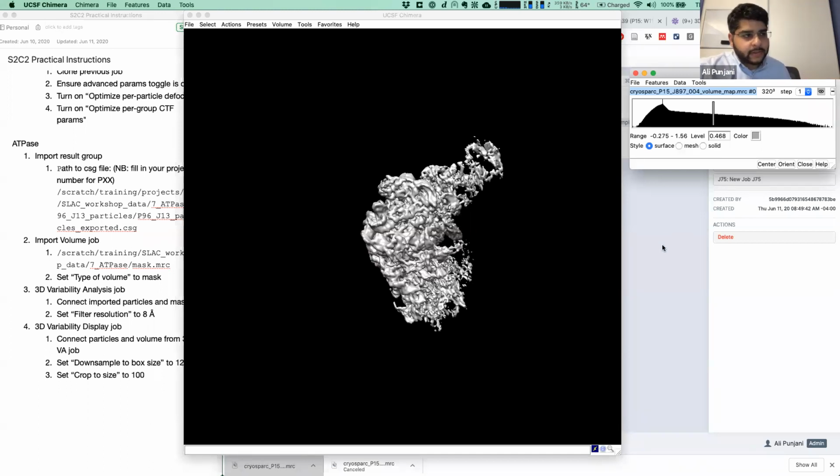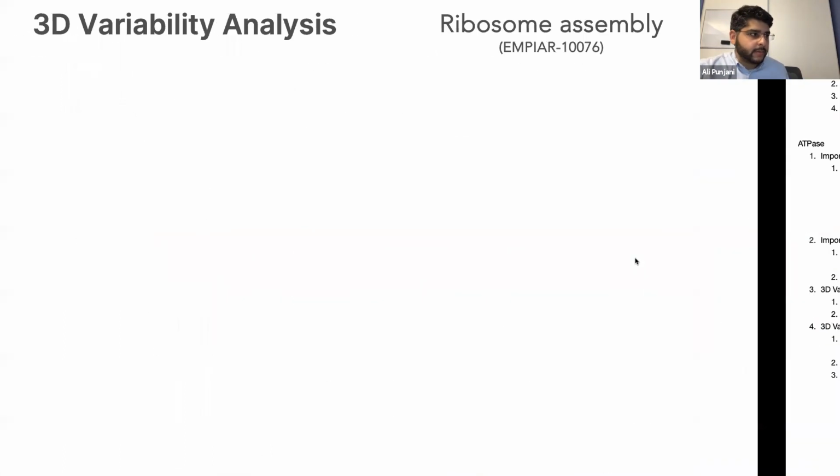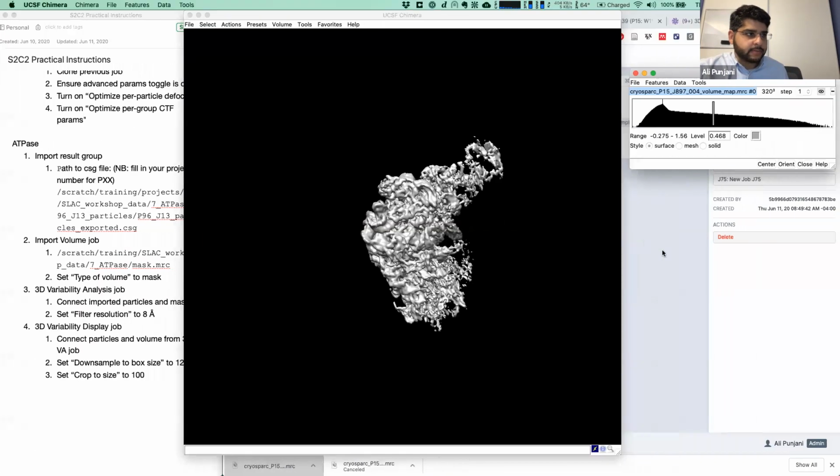We can actually do something interesting with 3D variability analysis on the same kind of data set. And what that looks like is putting all those images into 3D variability analysis. And instead of the variability components now encoding for motion, because the variability in the data set is to do with appearance and disappearance of subunits, that is actually equally well captured in the linear subspace model.